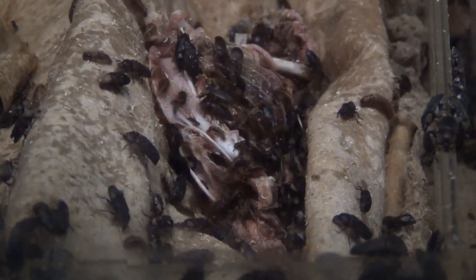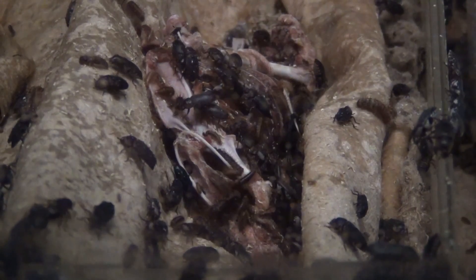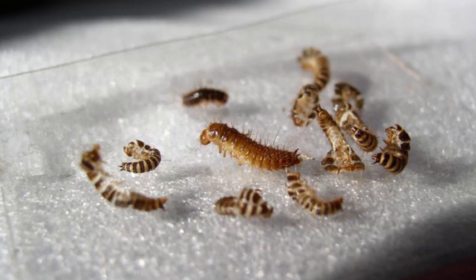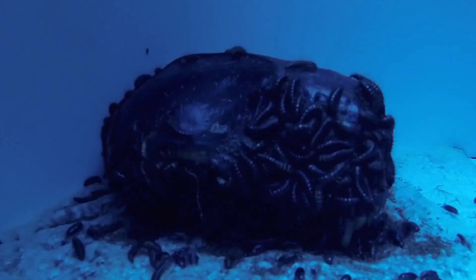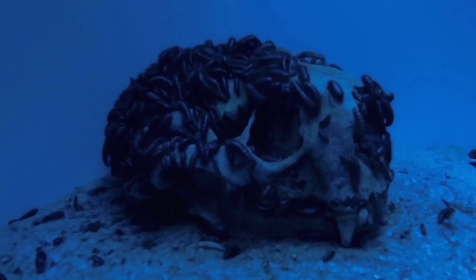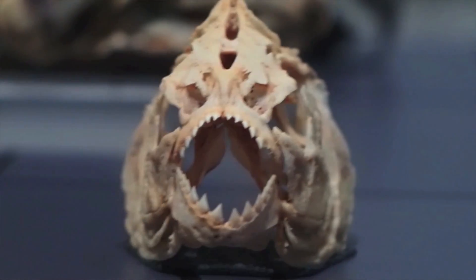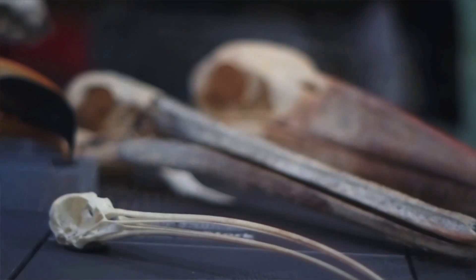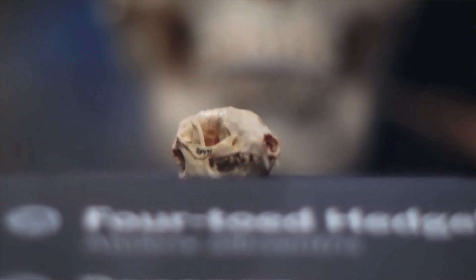Smaller specimens are cleaned by dermestid beetles. During this process, the bones are placed into a container full of colonies of these beetles, where beetle larvae feast on the flesh. When the specimen is ready, preparators carefully remove the beetles with tweezers. Dermestid beetles are used for fish, amphibians, reptiles, all the birds, and very small mammals.